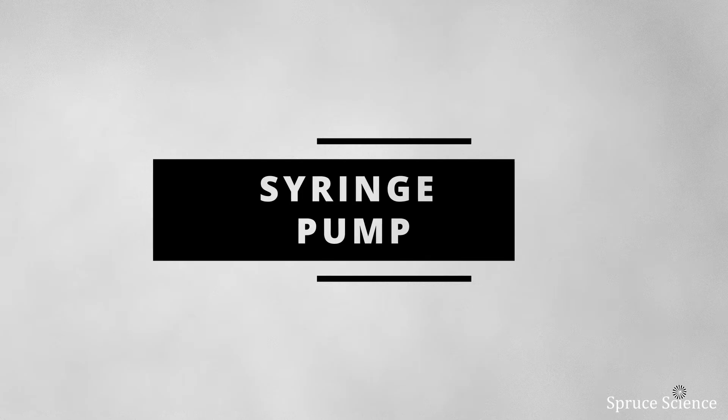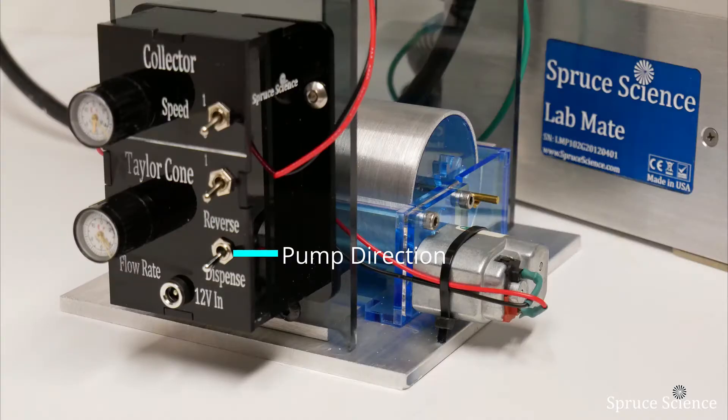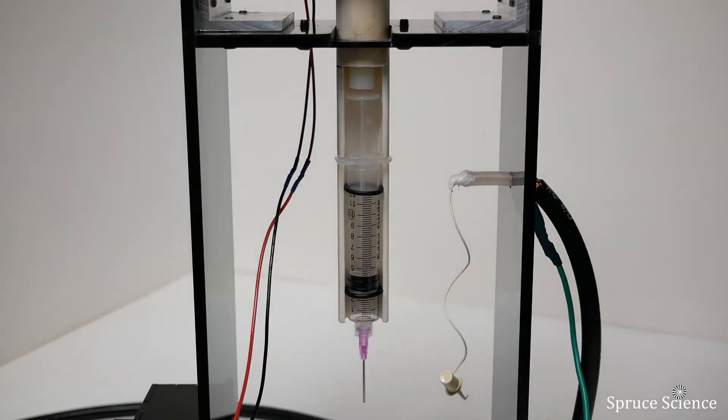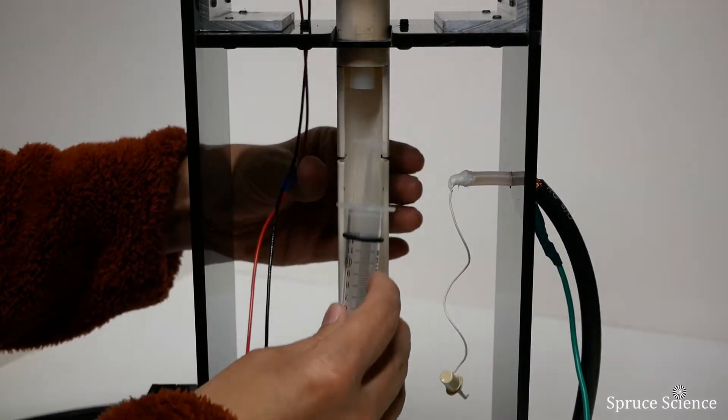In this section, we will illustrate the syringe pump usage. On the control panel, push the switch upward to reverse and turn on the pump motor switch. The pump motor will rotate at maximum speed when traveling in the up direction. After the highest position is reached, carefully remove the syringe from the white tube housing.